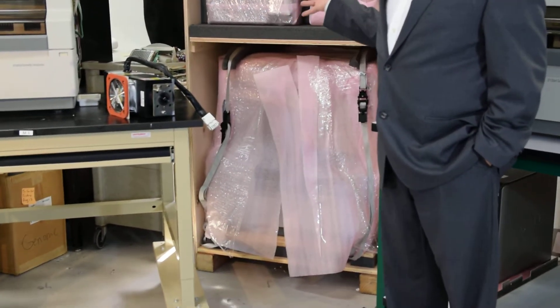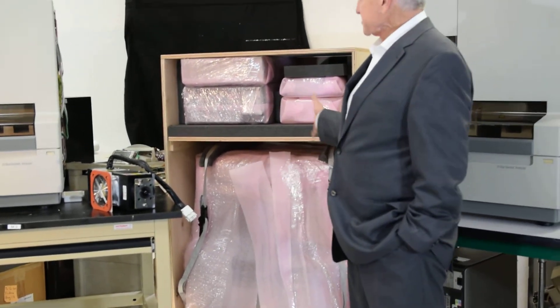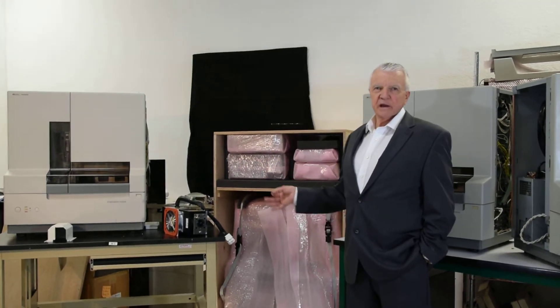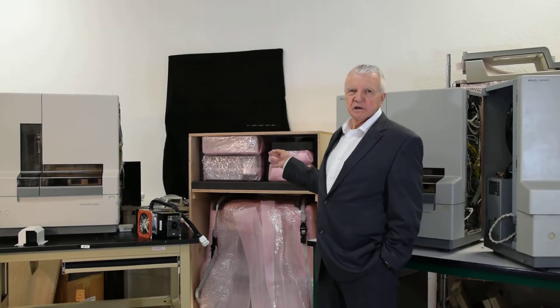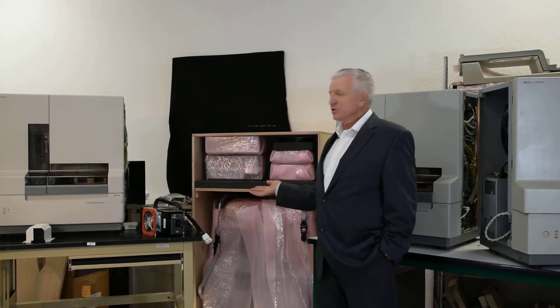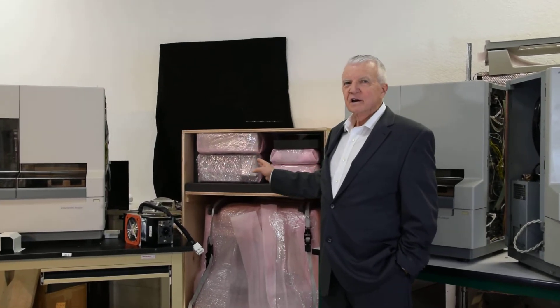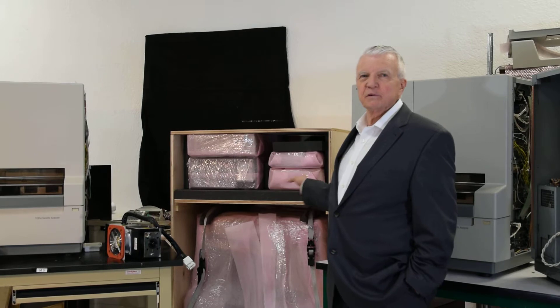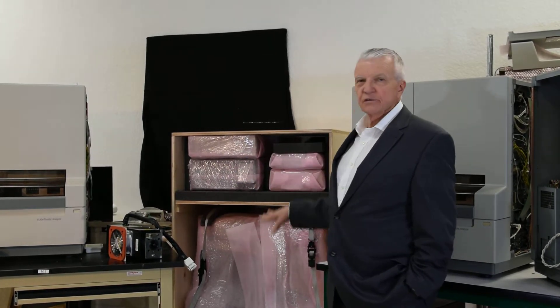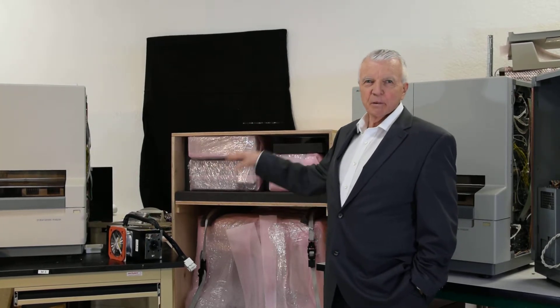That way they're more respected by your average forklift driver. It's the best insurance we can get, because when you've got something with a quarter-inch panel and a crate that looks beat to hell, the forklift driver treats it accordingly. These they treat a little nicer. Generally speaking, we've sent these all over the world and they arrive in good shape because it's really difficult to put a forklift through the side of a three-quarter-inch maple plywood crate.